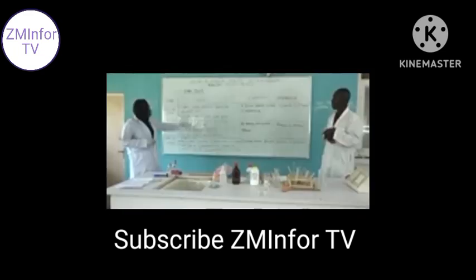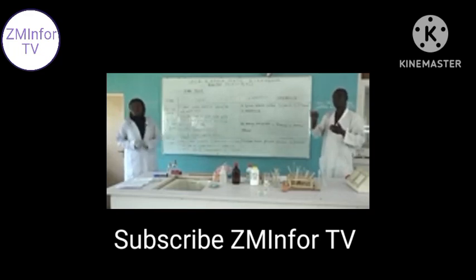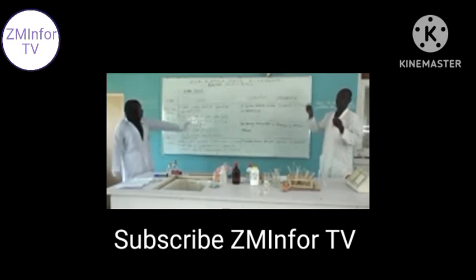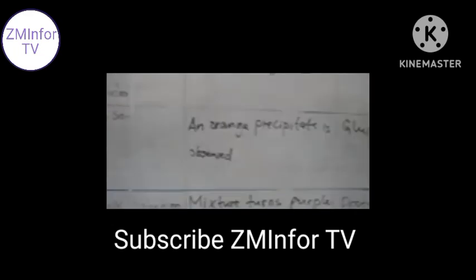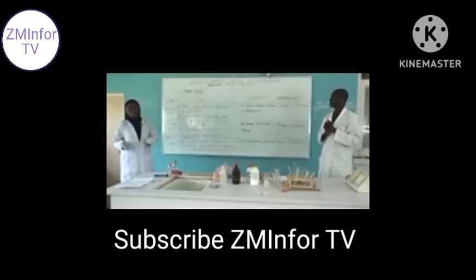We put a small quantity of glucose solution. We used the laboratory glucose. We diluted it, we dissolved it to have a solution, and then we added the Benedict solution, and we boiled, we heated it using our source of heat, the Bunsen burner, and then we had an orange precipitate being observed. The orange and the brick red gives the presence of glucose.